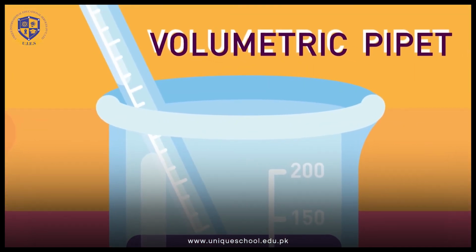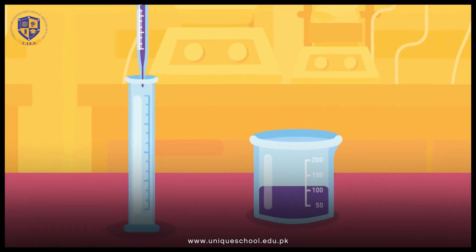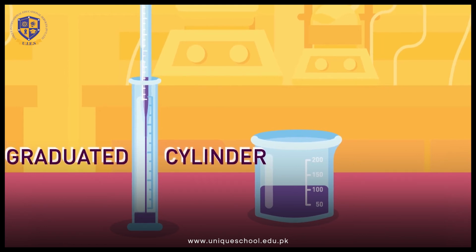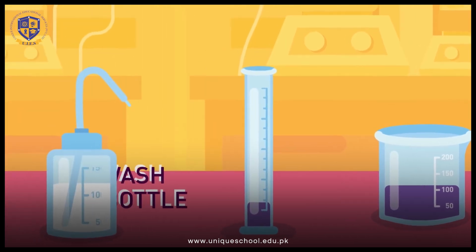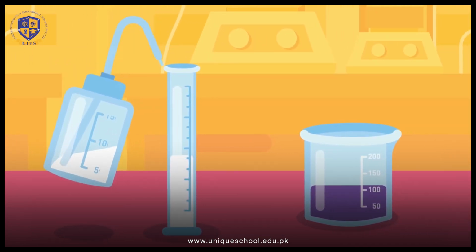Volumetric pipette. This comprises a graduated glass tube that is used to measure an exact volume of liquid. Be sure to use pipetting aids for precision mixing. Graduated cylinder. Used to measure a precise volume of a liquid. Wash bottle. Used to rinse pieces of glassware and to add small quantities of water.